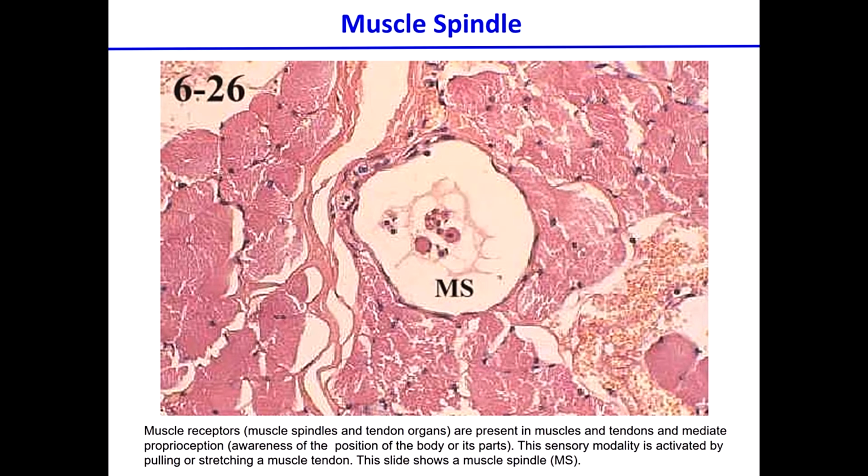This is simply a transversal cut of that spindle. It is a point inside the muscle where blood vessels and nerves that come and go all coalesce in that particular location, and this is a structure of it. Start getting used to seeing these things because I'm bringing some of these on Monday too.